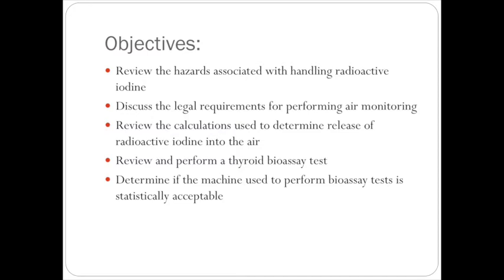Pretty much in a pharmacy, they have this set up so that it's a computer-based program, and so most pharmacists don't have to spend a lot of time doing any kind of calculations specific to this test, but we will at least talk about what the requirements are and how that relates to what we actually do during the test.